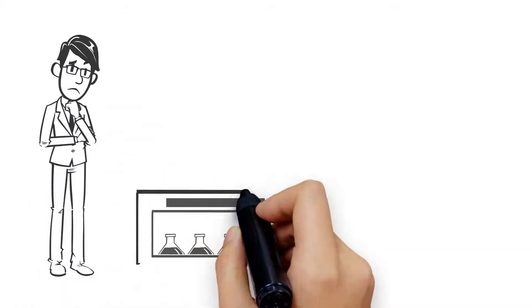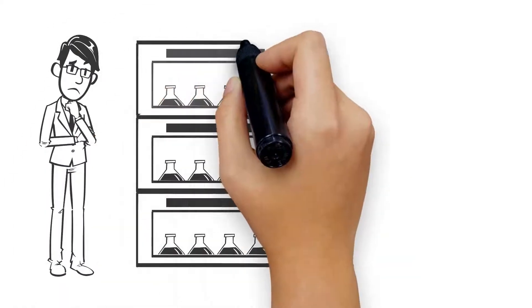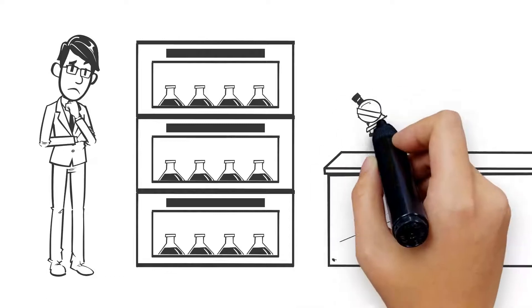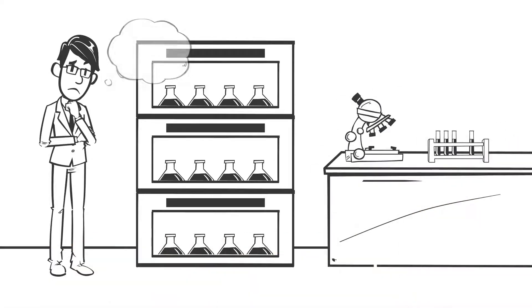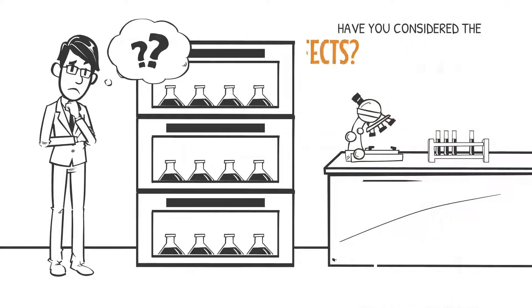Do you ever get lower biomass yields or cell viabilities than expected? You've prepared the shake flasks correctly and chosen the appropriate shaking throw and speed, but have you considered the evaporation effects?